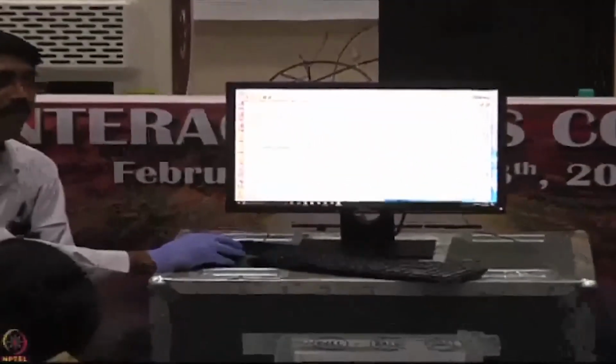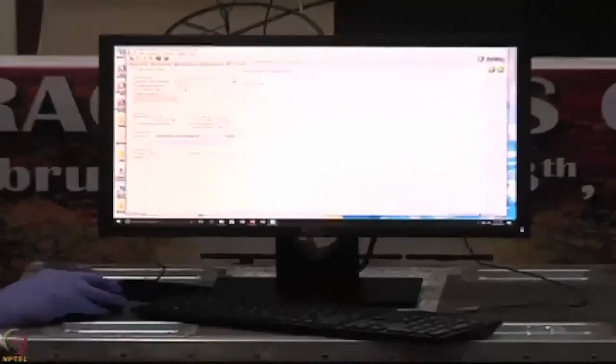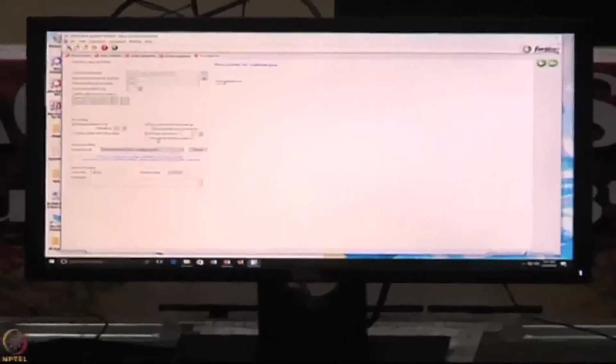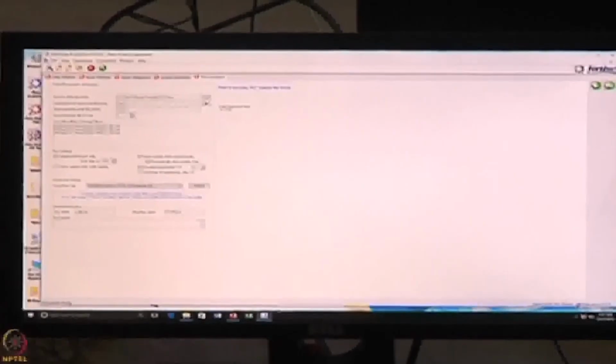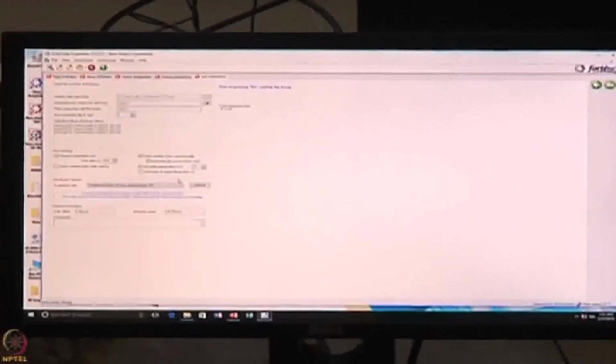So then you can mention the plate temperature. You can work from 15 degrees to 40 degrees. Now it is around room temperature, 23 degrees. Even after the experiment, do you want to hold that temperature, once again back to 23? Yes, you can click it, not a problem. So after this, we have done the experiment setup, you can say. Then we can say start go.